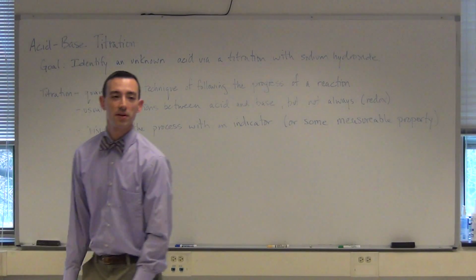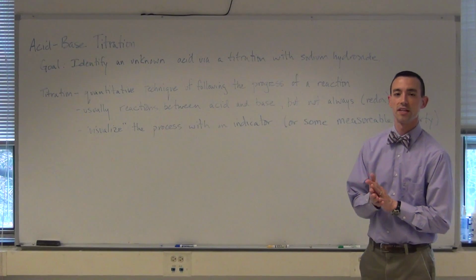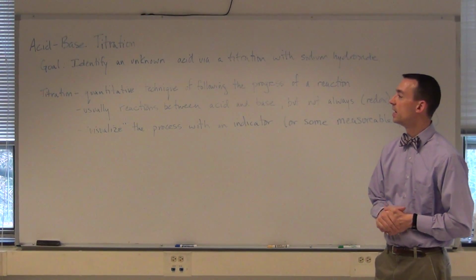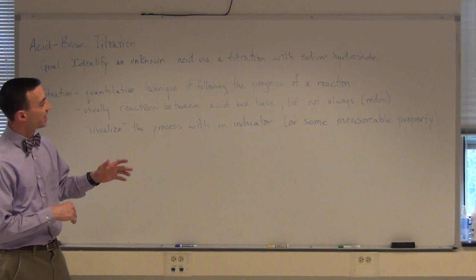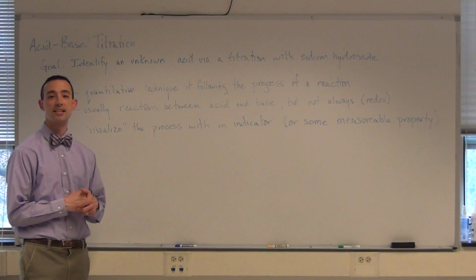Hello and welcome to the pre-lab video for the acid-base titration experiment, which is part of the General Chemistry 2 sequence at York College of Pennsylvania. The goal of this experiment will be to identify an unknown organic acid, and we will do that via the titration of our acid with the strong base sodium hydroxide.